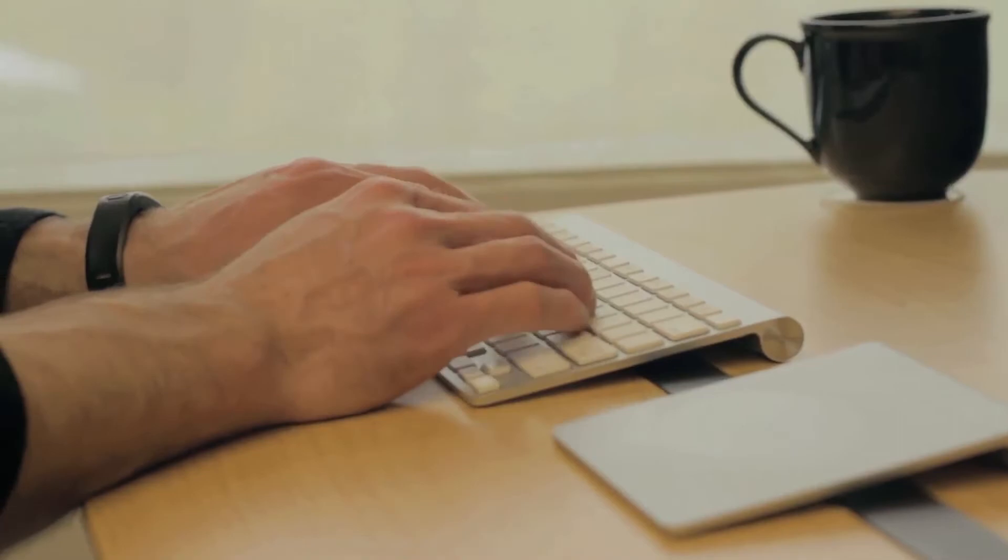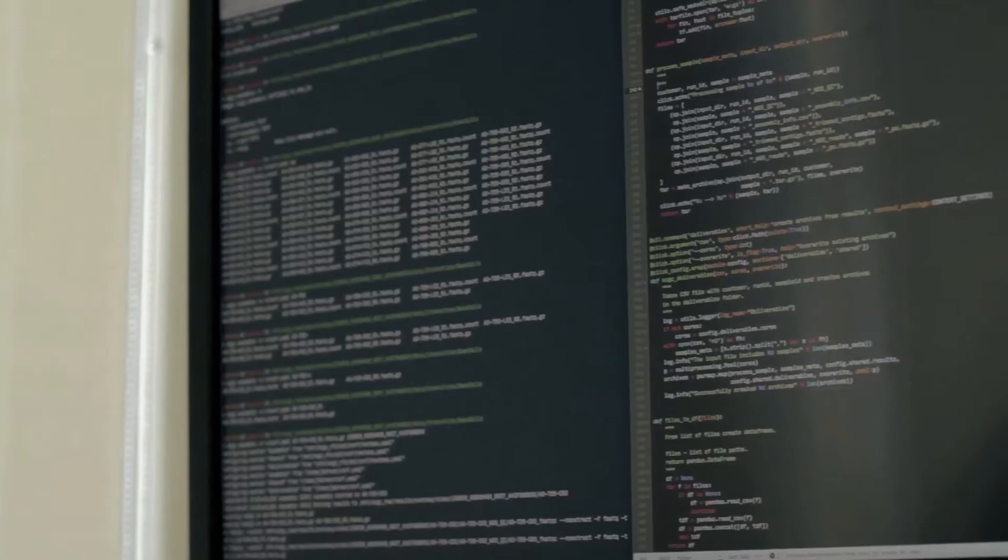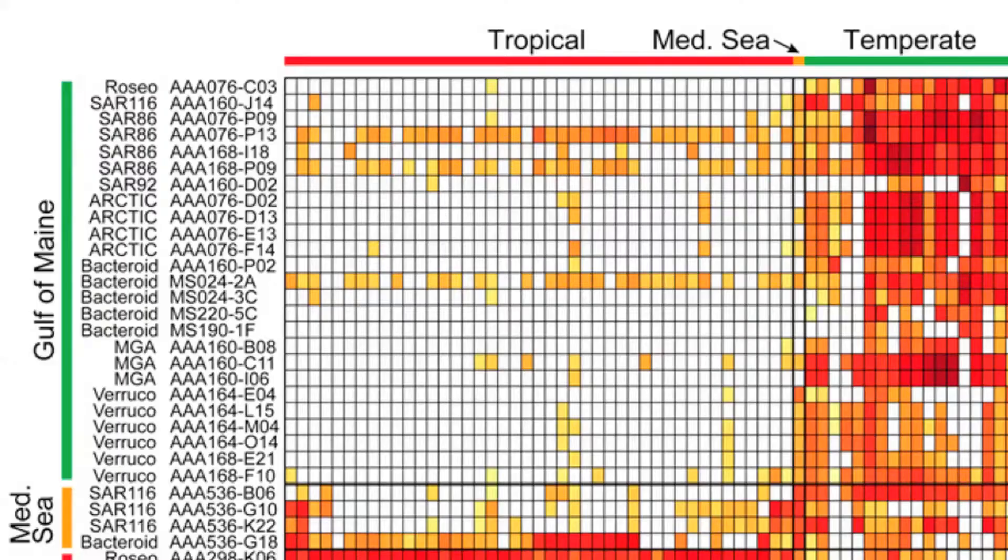Data collection starts with a recording of field sample metadata, then continues into the recording of cell's optical properties during sorting, then proceeds into the recording of DNA amplification conditions and speed, and finally into the genomic sequencing.